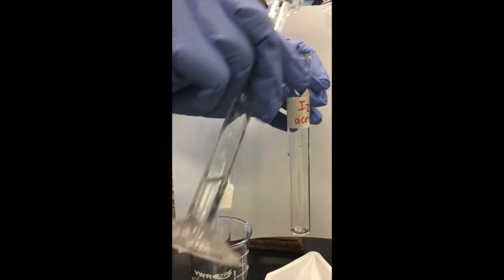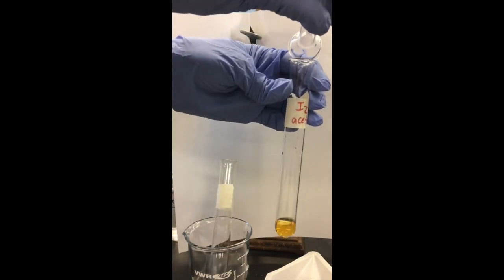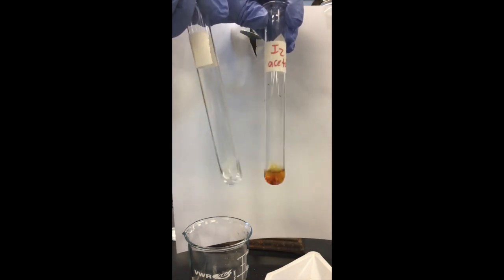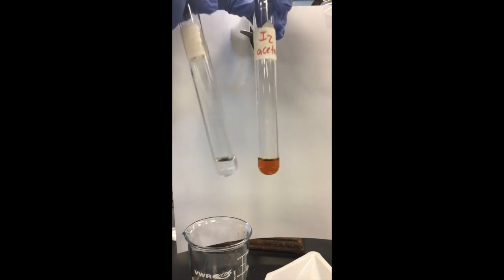That one. And then into my second test tube, I have acetone. And I'm going to put in 2 milliliters of acetone to that test tube. And then we're going to gently shake our test tubes for a minute and determine which one the iodine is more soluble in. So you'll be looking for a color change here.